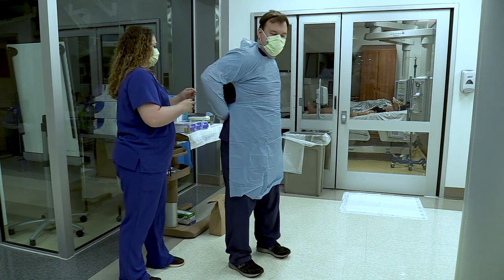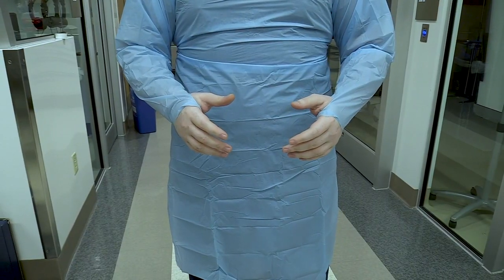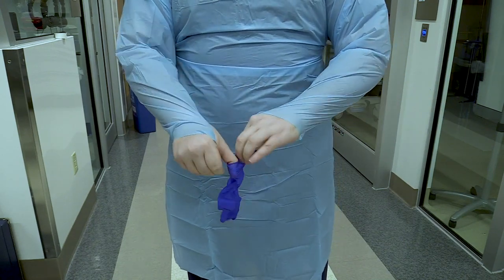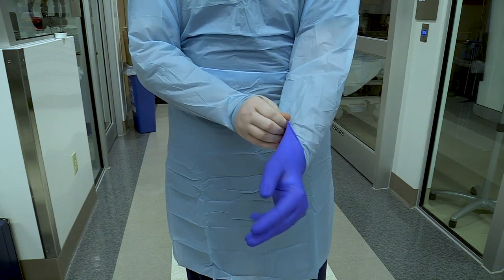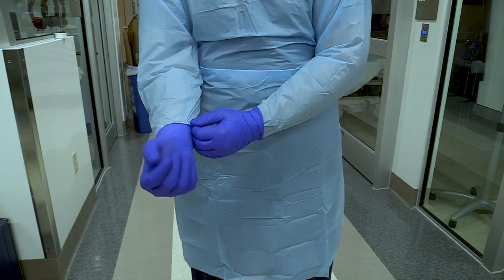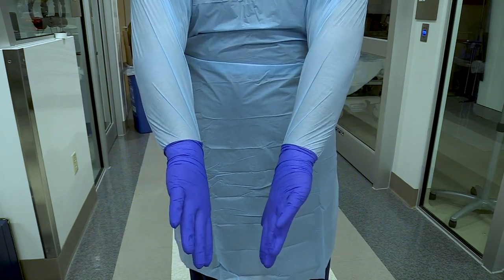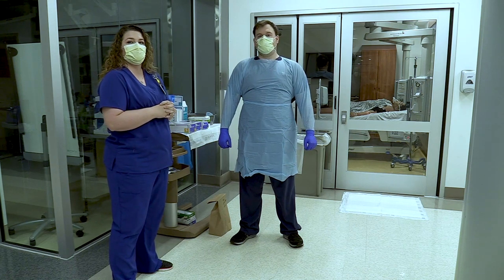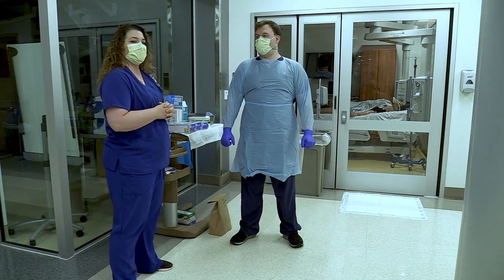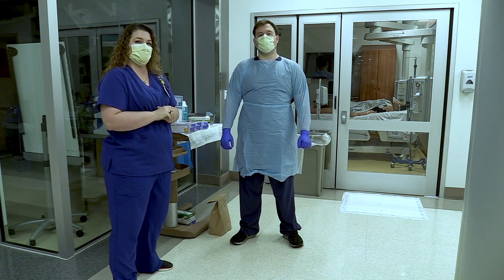Once the gown is on, we can move on to gloves — one pair, placed over top of the gown sleeves. It's only required to use one pair of gloves in these rooms; however, we're going to treat those like an extension of our skin. Once he enters the room, if there's a skill he would normally don gloves for, he'll don a second pair over top. Once he's completed that skill, he can doff those and then sanitize the under glove to make sure his skin is protected while in the room.